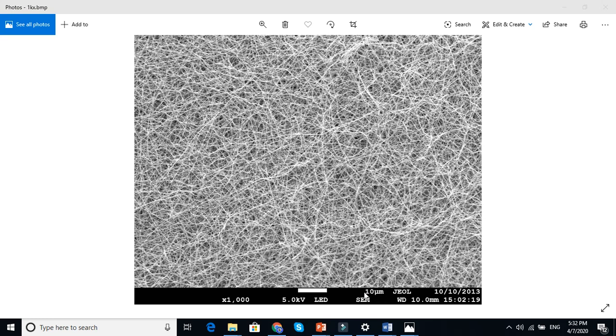If you do not have a tool to measure the diameter or length of a nanofiber, you can easily understand the size of your fiber from here. This is a 10 micron scale. You see this white scale here, so you can understand how small your nanofibers are.